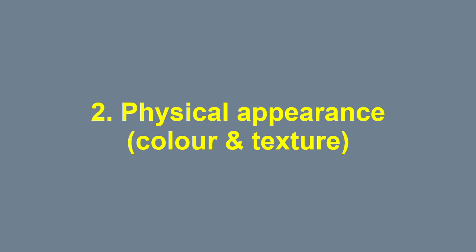The texture, whether crystalline or powder, might also be helpful, although this can be affected by storage conditions of the salt. Most crystalline salts are hydrated, and once they lose the water of crystallization, they may become powdery and their color may also change, so do not rely on just texture and color to confirm the cation present.